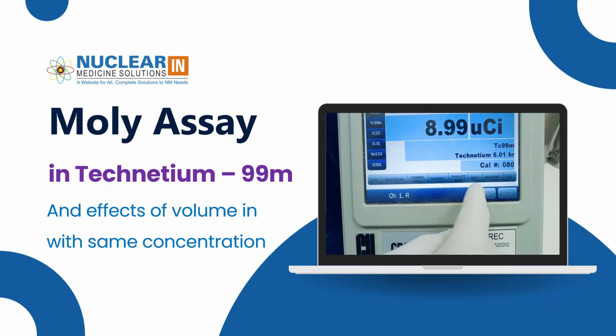Hi, this is Divya Prakash, and today we are going to see how the Moly assay can be done in Capintec dose calibrator. And also we'll see how the effect of volume with the same concentration changes the results of Moly assay. So first of all, we'll see what is Moly assay.